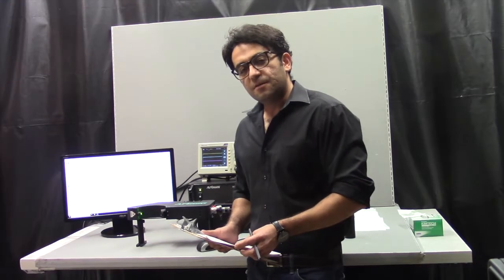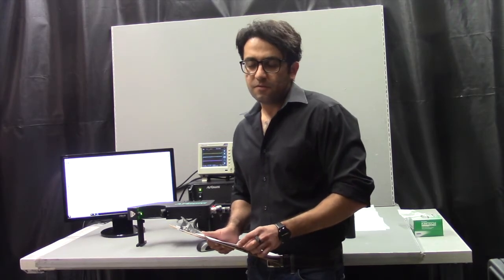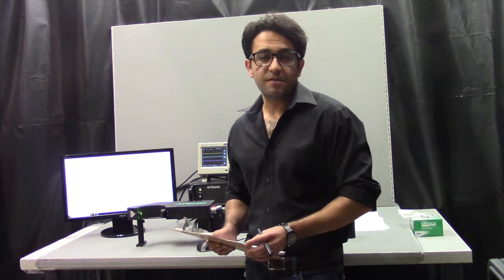What we do in Artium Technologies, we make instrumentations that measure the size, the velocity, and the shape of tiny particles.